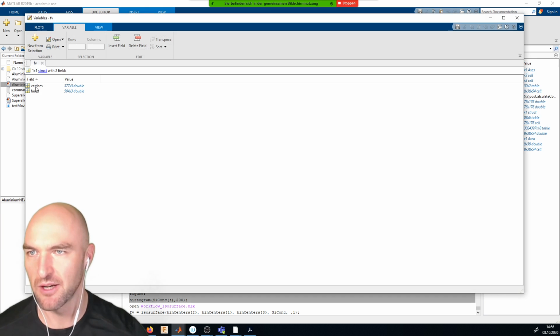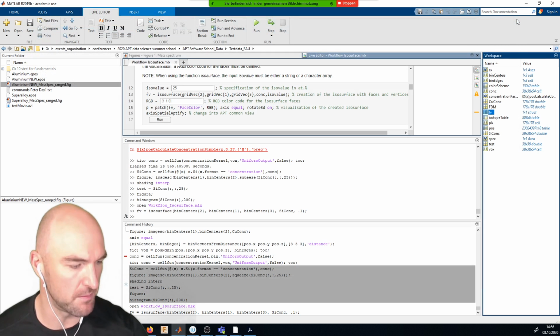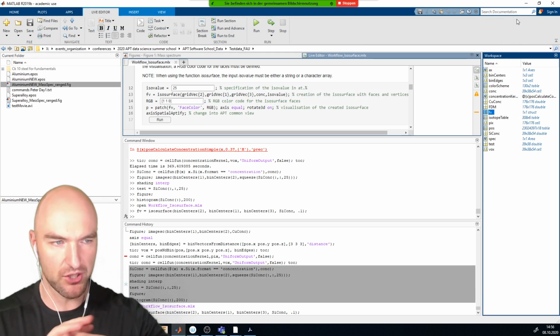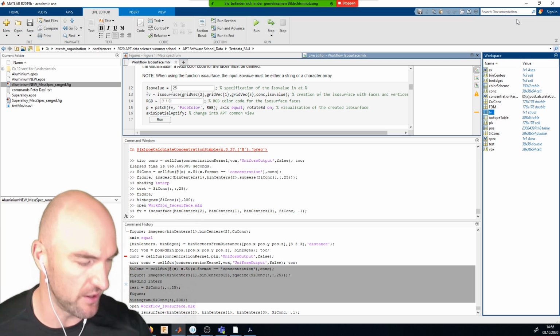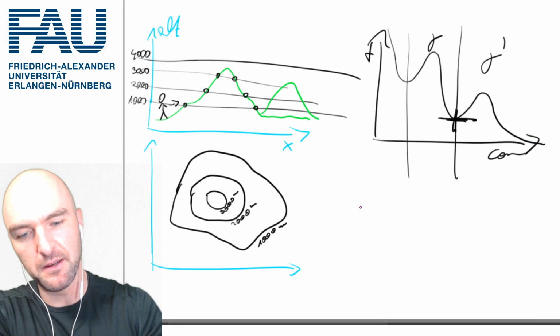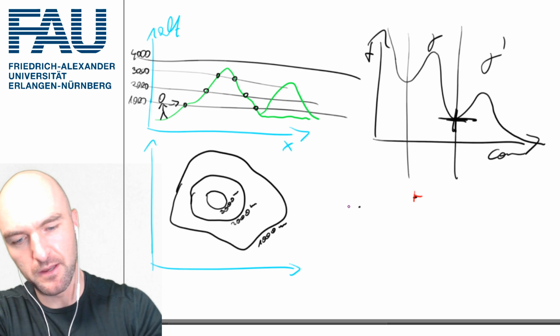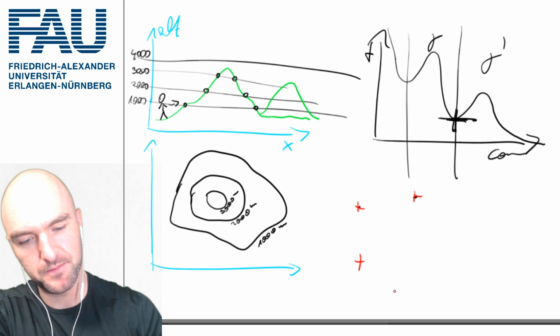And it consists of vertices and faces. And you'll hear a lot about vertices and faces tomorrow. So essentially, if we want to display a 3D mesh, so any kind of free-form geometry in 3D, the way we do that is by defining certain points.